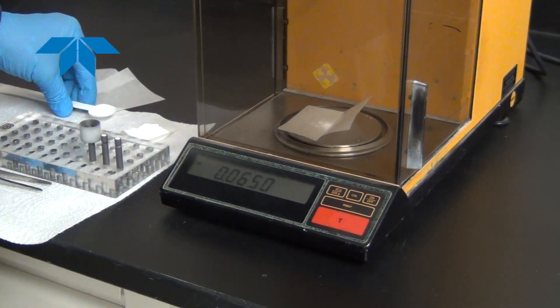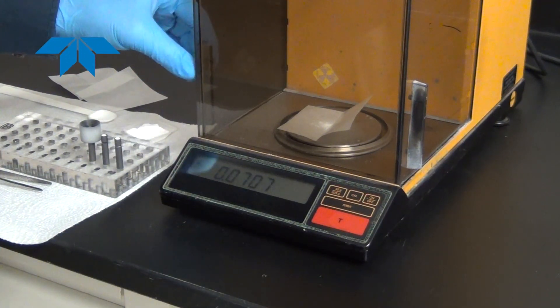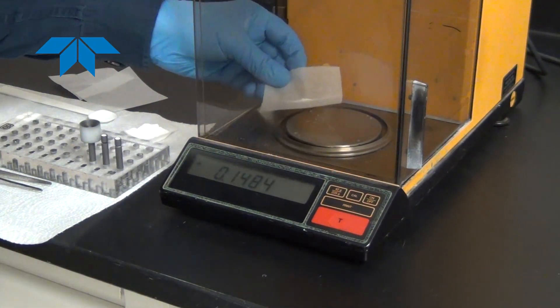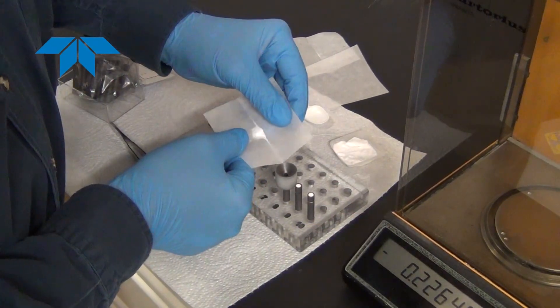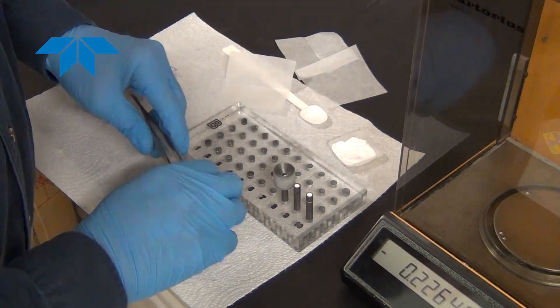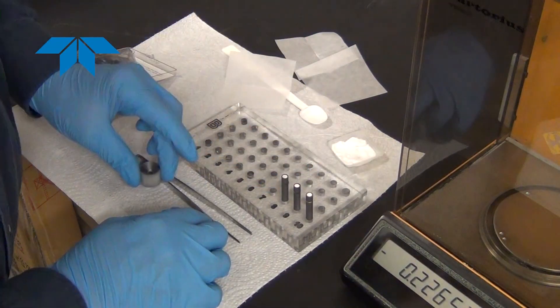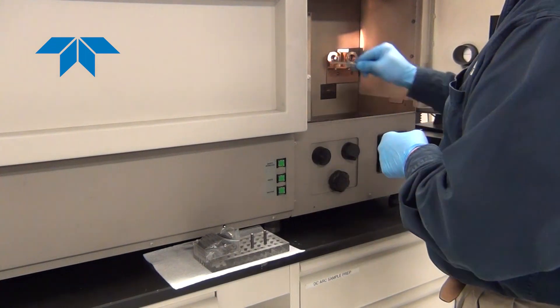First, the sample is weighed and then transferred into the appropriate electrode using a plastic funnel. Once the electrode is loaded, it is ready to place in the instrument.